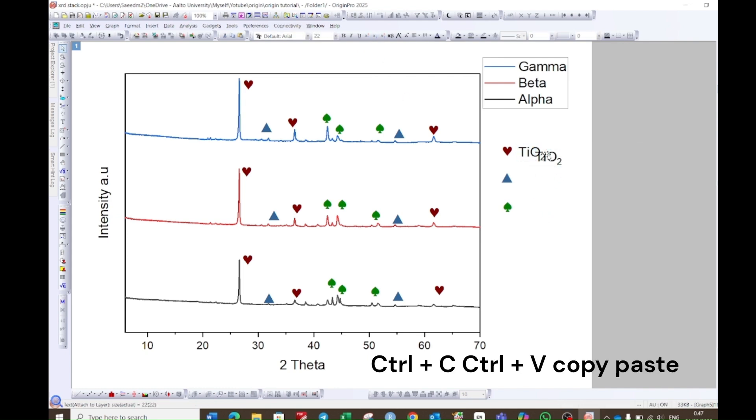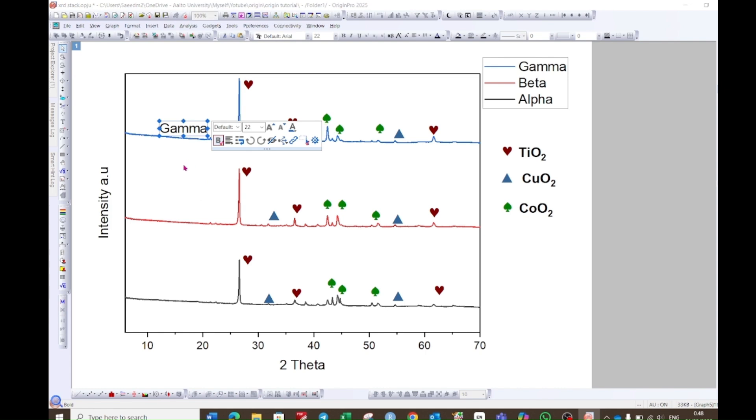Copy it and paste it twice so that it will be done for other substances also. Select text and make them bold. Select the text button again. Click right next to the layer and write the name. Select the text and make it bold.